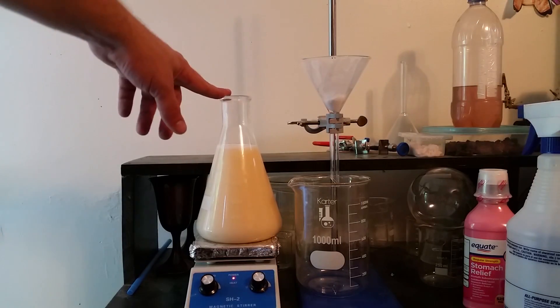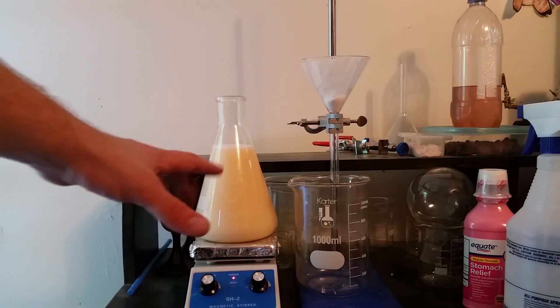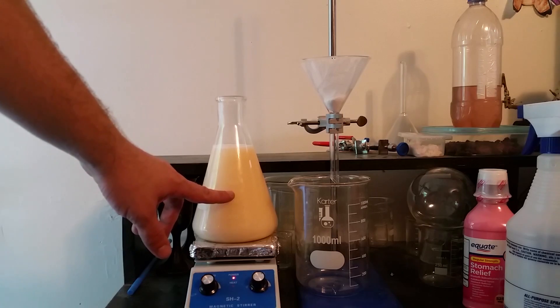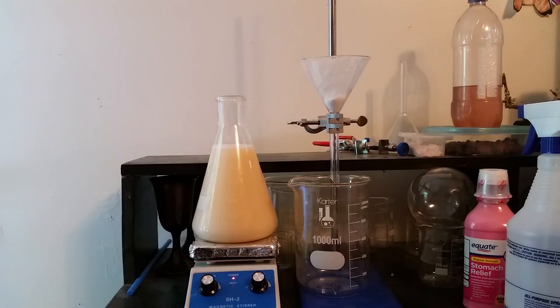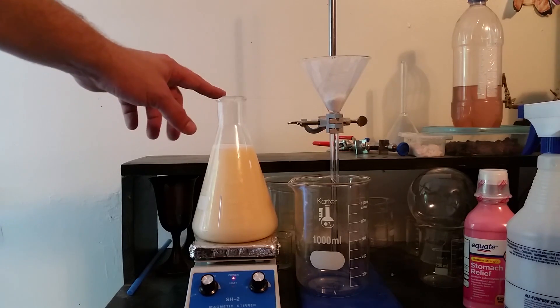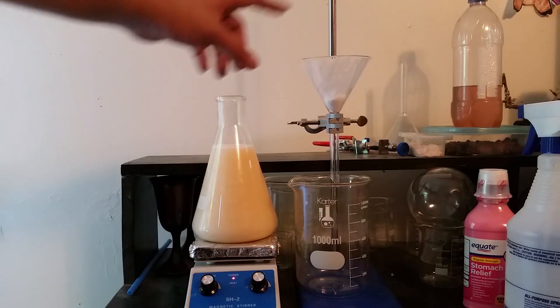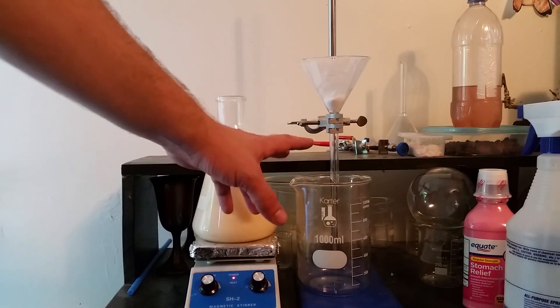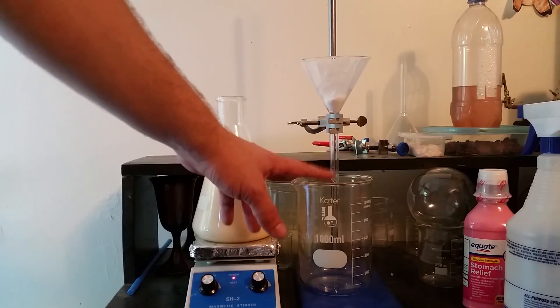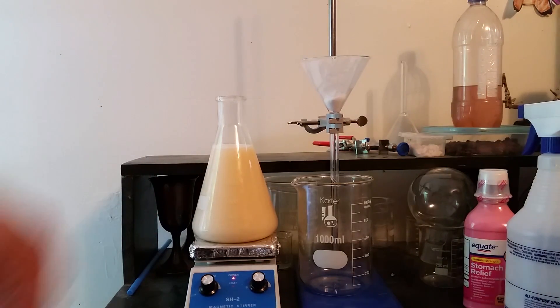I've been letting this stir for about an hour now, and now it's time to filter it off, leaving the bismuth chloride behind. The precipitation you see right now — the white precipitate — is primarily salicylic acid that's produced whenever the hydrochloric acid reacts with the bismuth subsalicylate, but that will be filtered off, leaving hopefully primarily bismuth chloride in the beaker below. I'm going to go ahead and start filtering this off and then we'll pick back up whenever it's done.